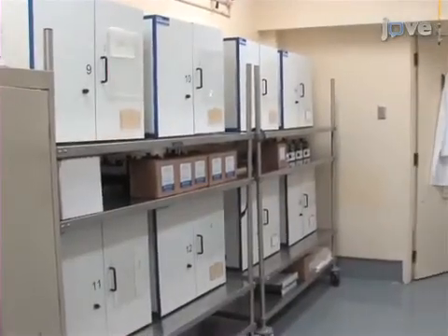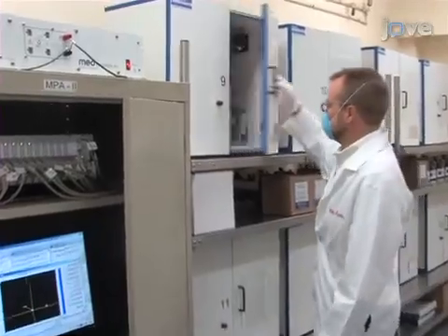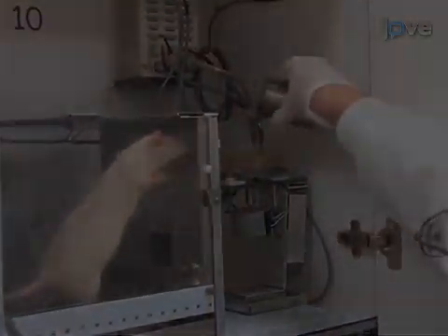Meal duration studies are performed in sound-attenuated chambers equipped with computer-activated pellet feeders. Add rodent chow to the food hopper, consisting of 45 mg pellets.